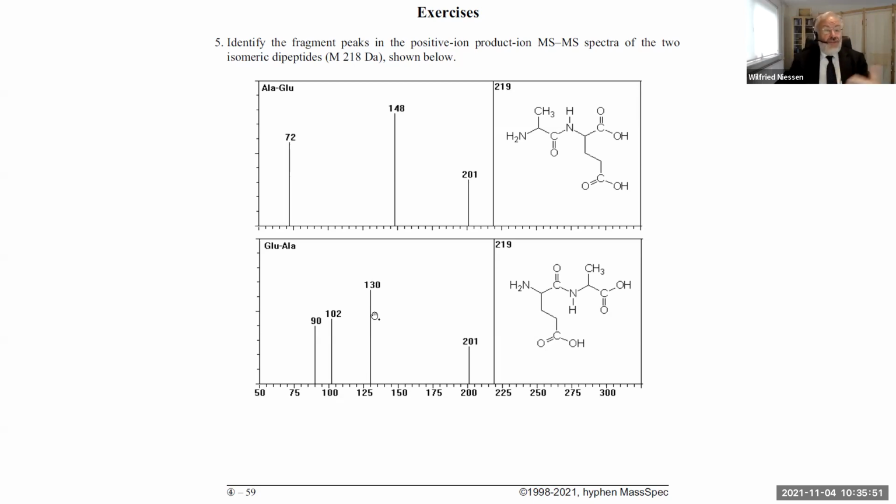And the fun of these two spectra is that you see that you have basically the spectra from two isomers where you just interchanged the sequence of the amino acids, and from the spectra you can derive what is the sequence. So you can extrapolate from this result that for a larger peptide you should also be able to get sequence information. Yeah, seeing the terminals. Right. Exactly.